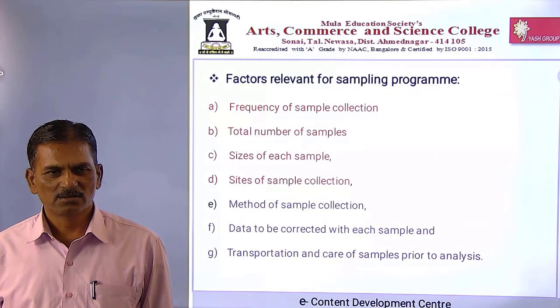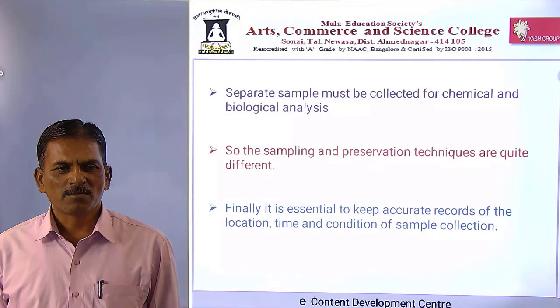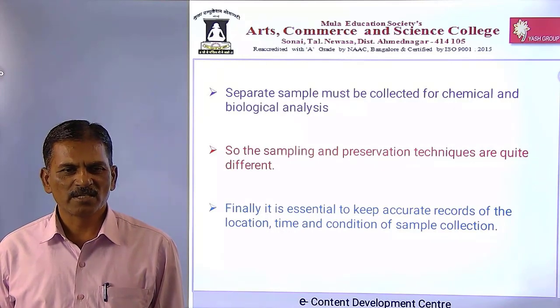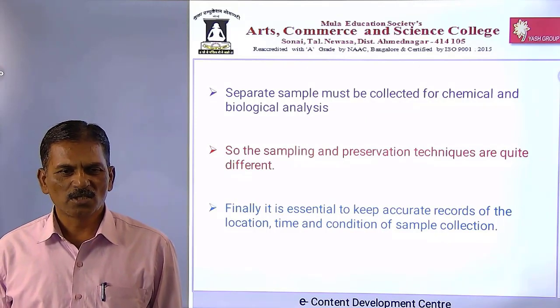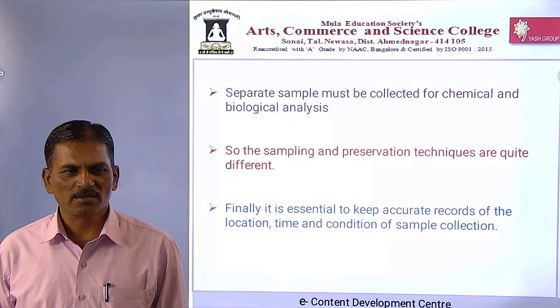Factors relevant to the sampling program. Separate samples must be collected for chemical and biological analysis, so the sampling and preservation techniques are quite different. Finally, it is essential to keep accurate records of the location, time, and condition of sample collection.